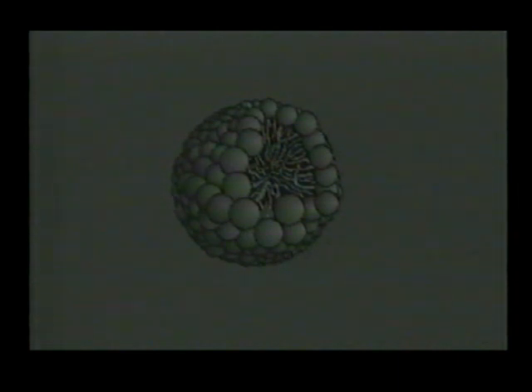Capillary electrophoresis is an excellent technique for separating species carrying differing charges, but there is an obvious difficulty in resolving neutral molecules from each other. To overcome this problem, micellar electrokinetic capillary chromatography, or MECC, was developed by Terabe in 1984.